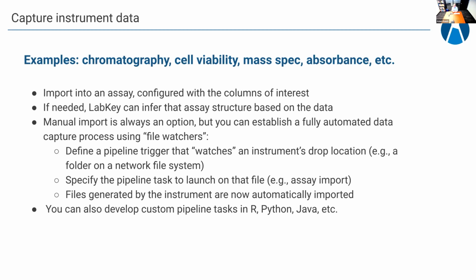But you really want to think about the cases where you're importing on a regular basis, many runs over time. You can establish a fully automated data capture process using what we call a file watcher. Basically, you define a trigger that watches a certain location in the file system, say a folder in the network file system where an instrument drops its results on a nightly basis.